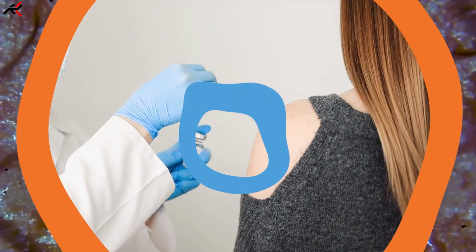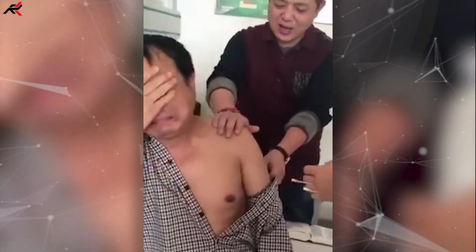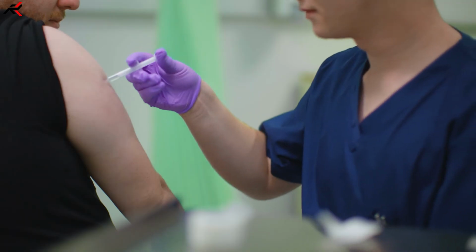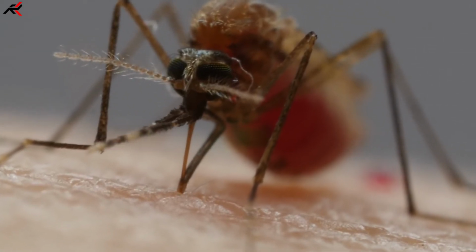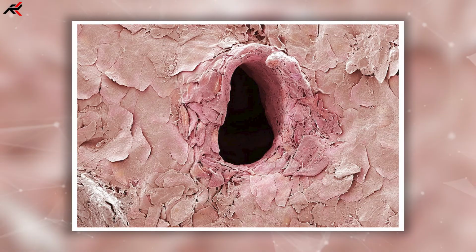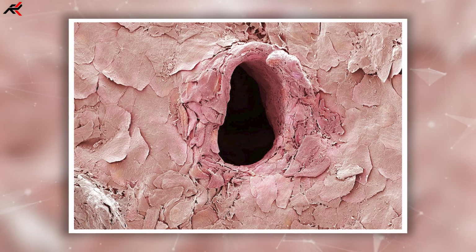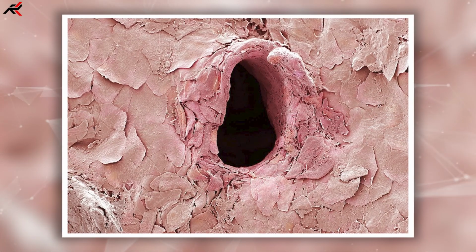Guys, none of us like getting injections because when the injection goes into our body, you get scared. But sometimes you must have been given injections, or else mosquitoes must have bitten you every day. But do you know what the mosquito bite surface and the injected surface look like under a microscope? When you look at it in the microscope, you will see some things like this, which look very weird, as if someone has made a cave.